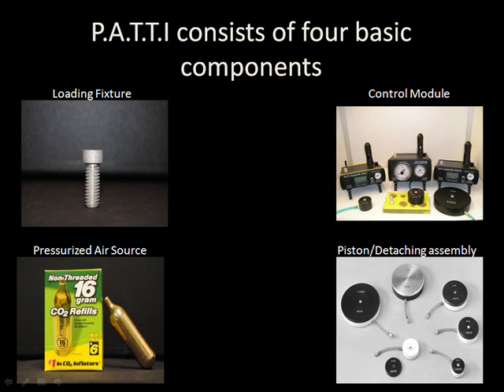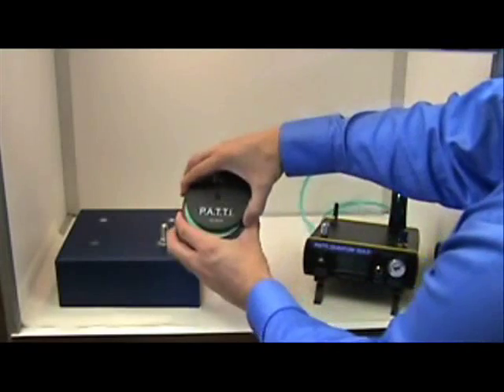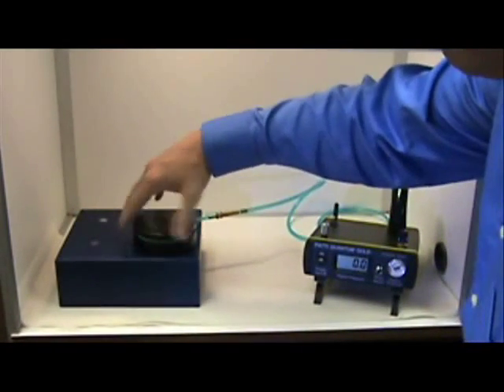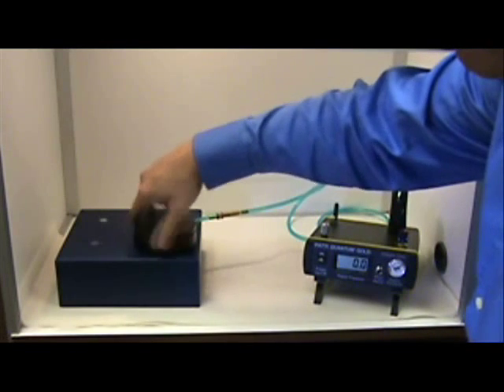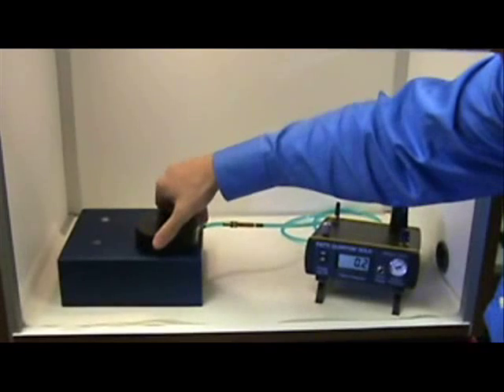And now for a basic demonstration of a Patti adhesion test. This test is being performed on a pull stub adhered using a two-part epoxy. It has been given 24 hours to cure, as per the adhesive manufacturer's directions.